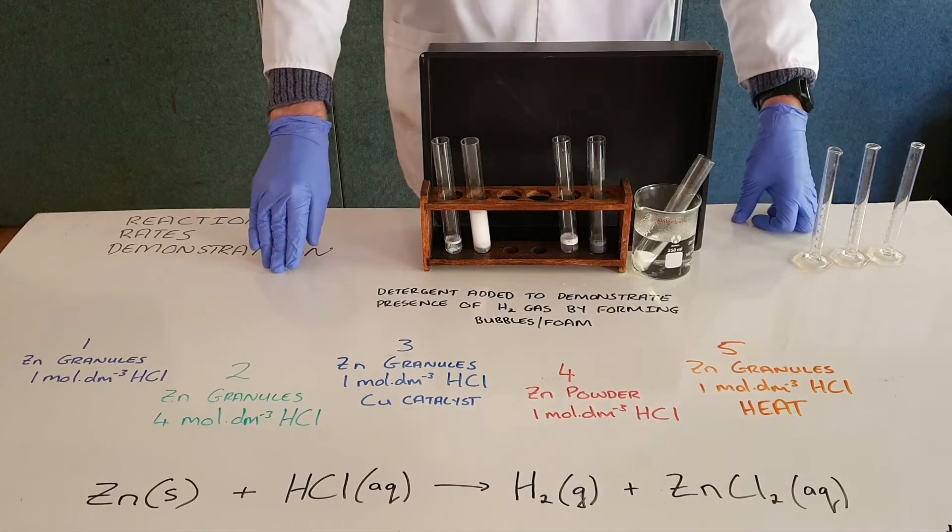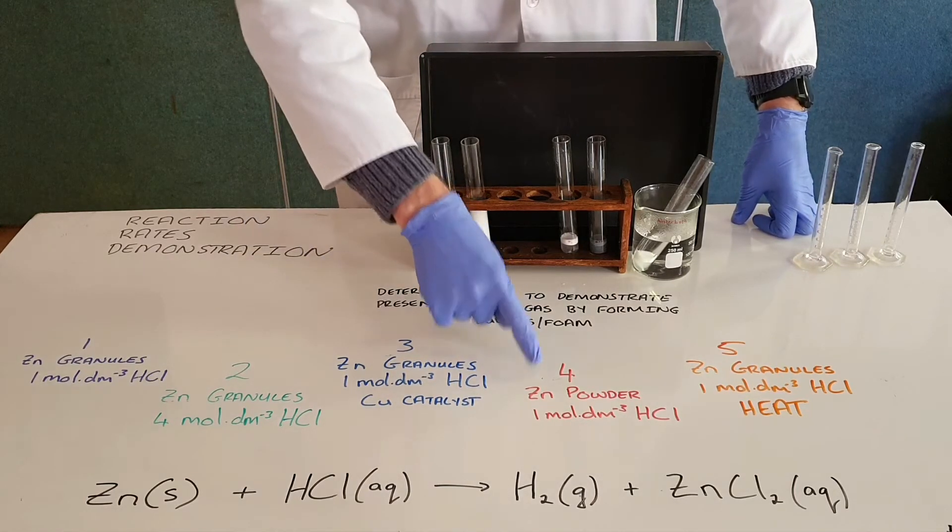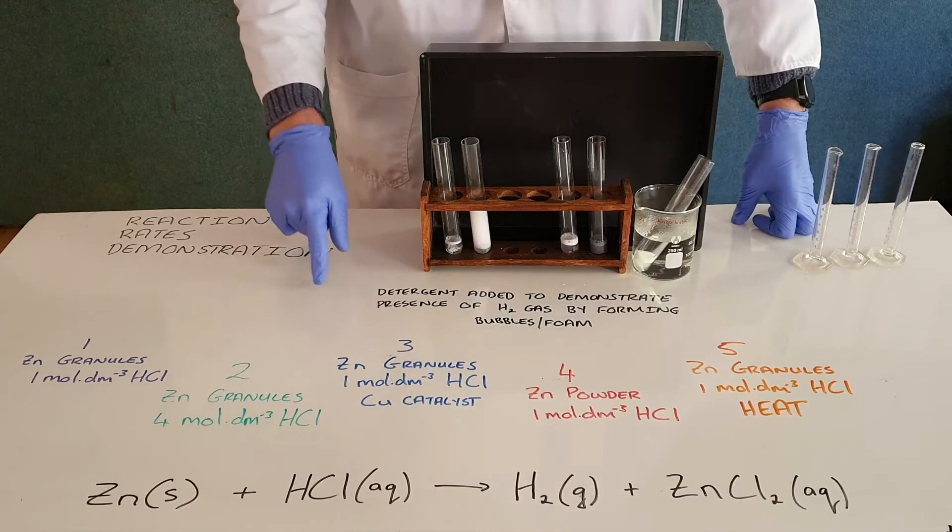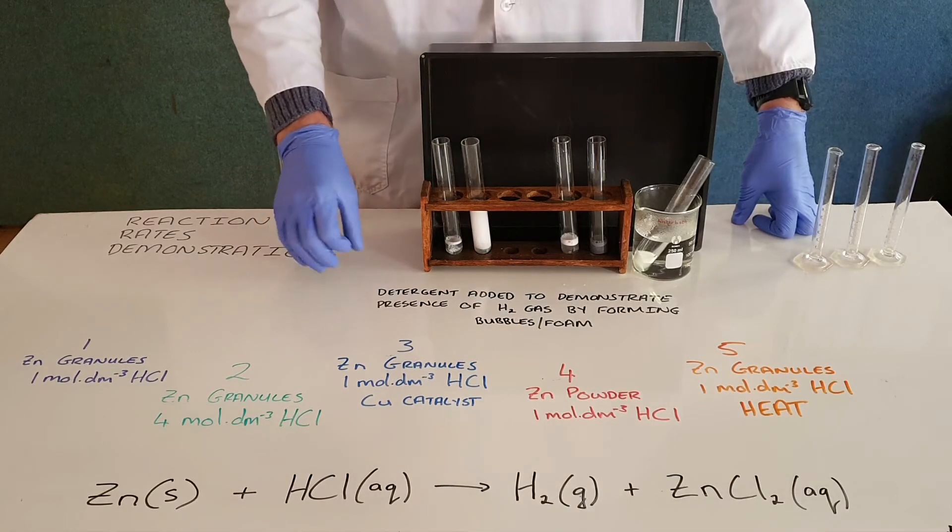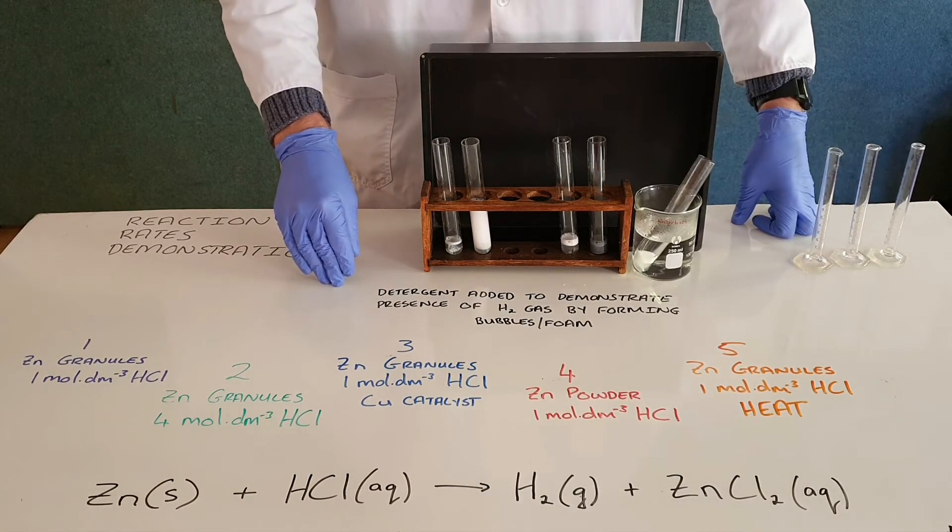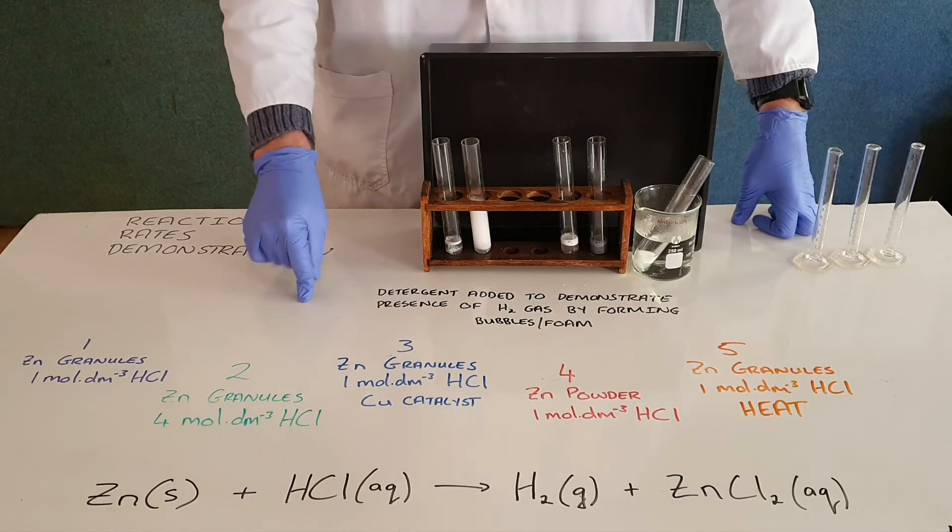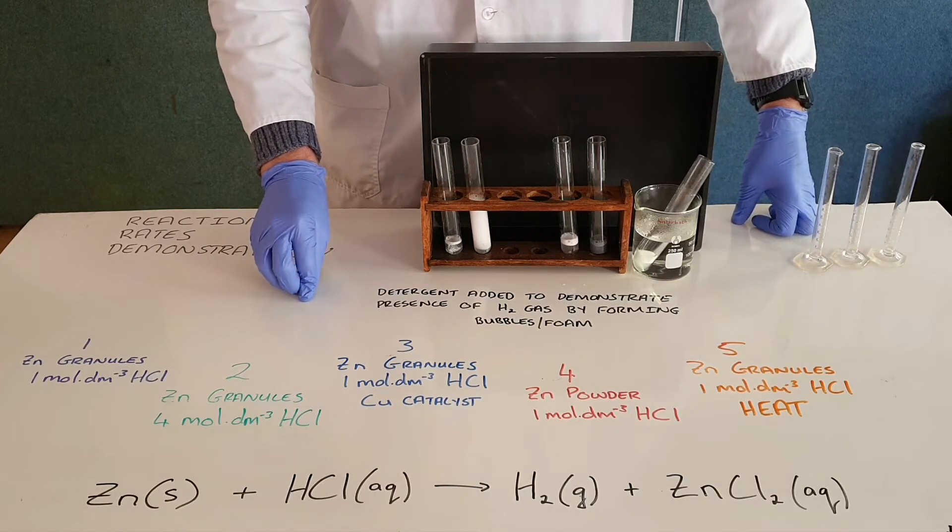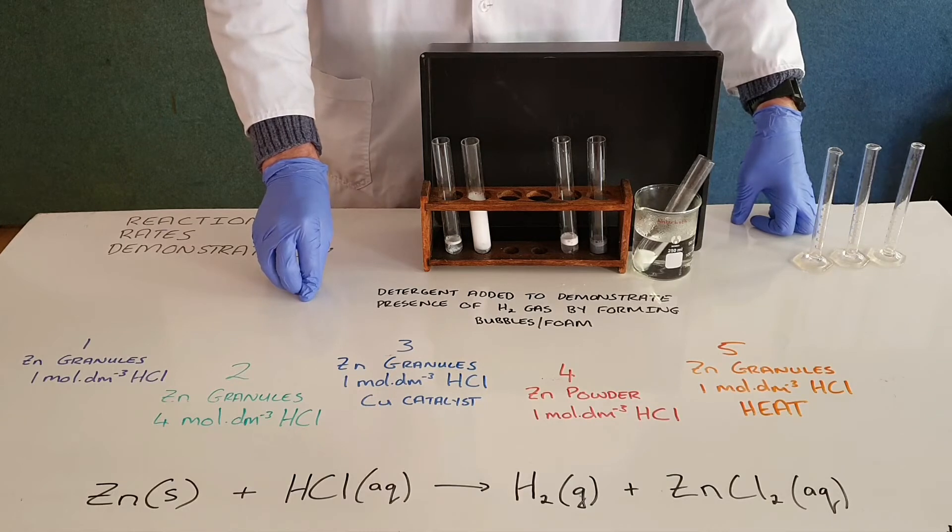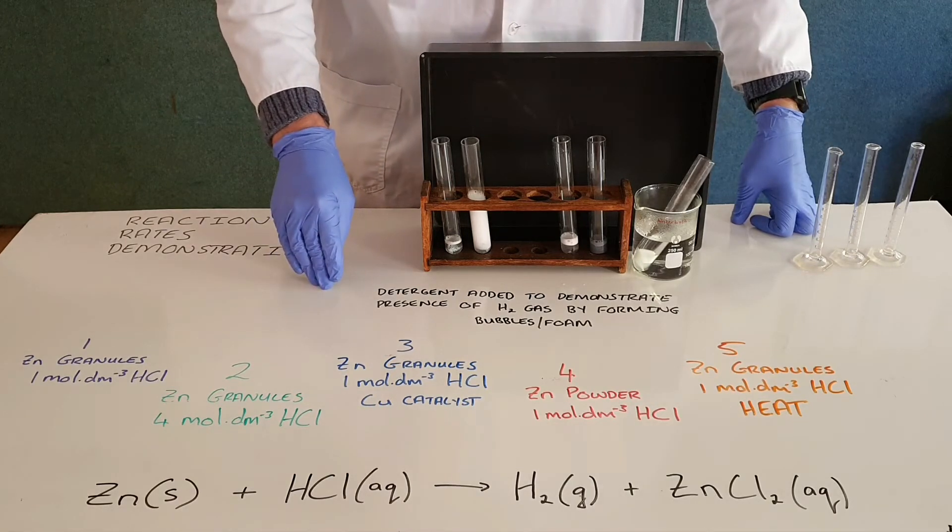The fourth test tube is a more complicated one. This is now zinc powder, so instead of using zinc granules or zinc chunks, we have now ground it into a powder, which means that we have increased the surface area of the zinc. So by collision theory that tells us that the reaction should proceed at a faster rate because there are more opportunities for collisions and therefore more successful collisions.